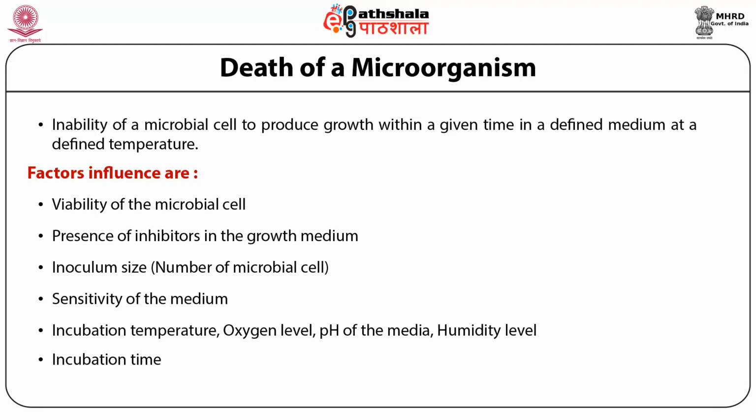Last factor, that is incubation time. Incubation time is also very important here. If the bacterial cells or microbial cells are incubated for a proper period of time, the bacterial cells grow faster, otherwise the growth will be minimum.